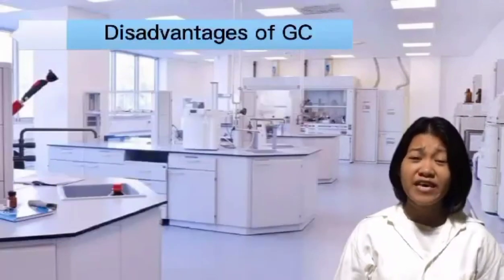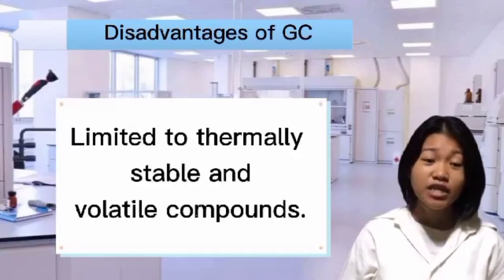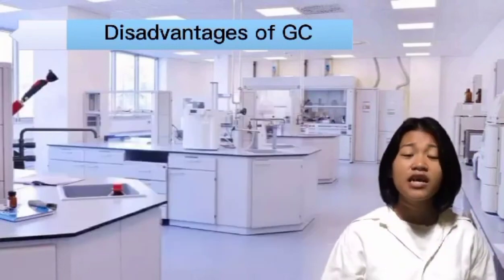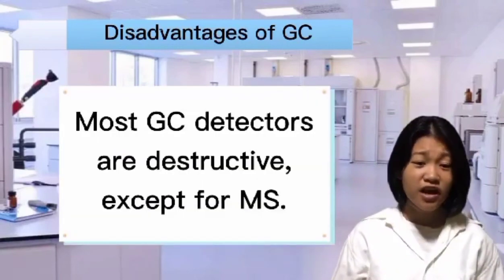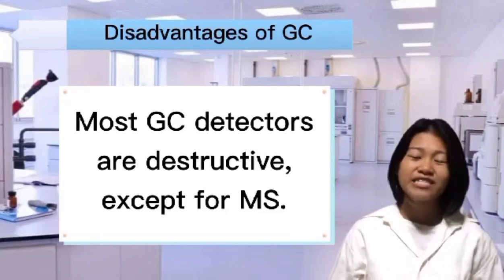Gas chromatography has 2 disadvantages. First, it is limited to thermally stable and volatile compounds. Second, most gas chromatography detectors are destructive except for the mass spectrometer.